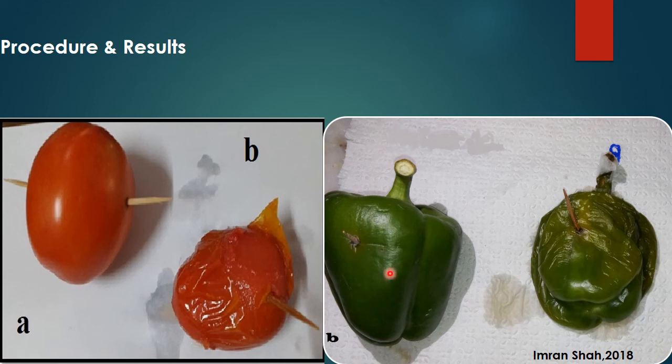In another experiment, bell pepper is inoculated with a toothpick dipped in sterilized water, acting as a negative control, while when the toothpick dipped in bacterial culture is inserted into the bell pepper, it results in the discharge of liquid material.